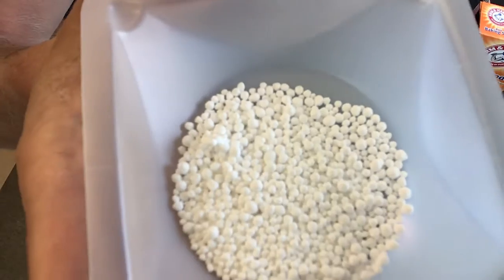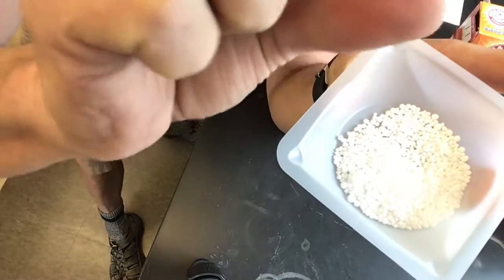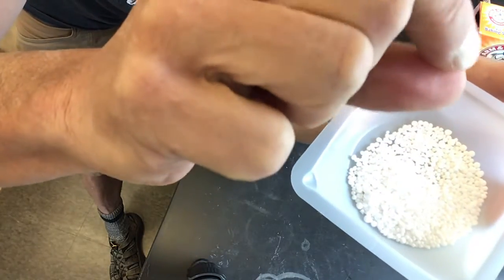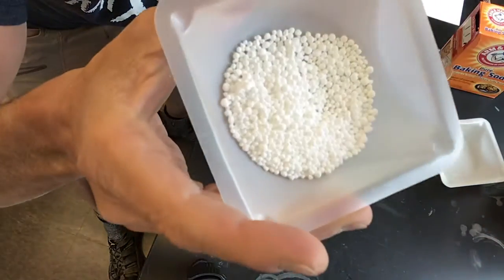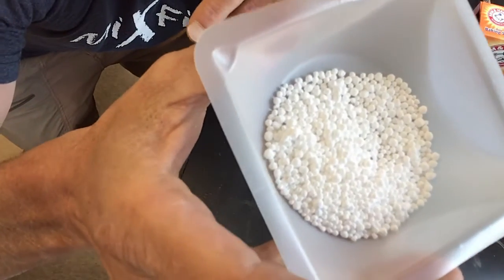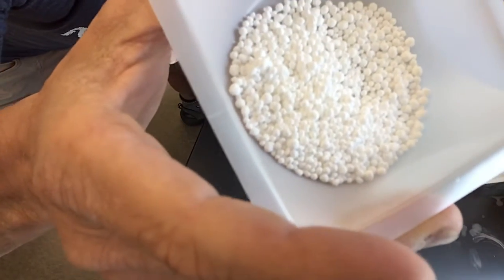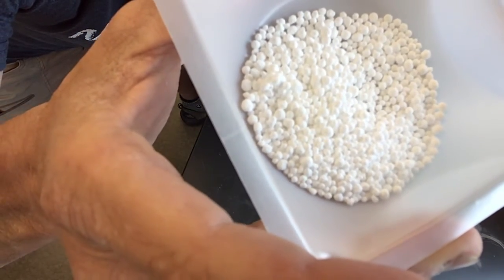As you can see, they're round, they're white, they're fairly hard. I can't really squeeze them. It stays a ball. So go ahead and make observations and record those in the second column of Table 1.